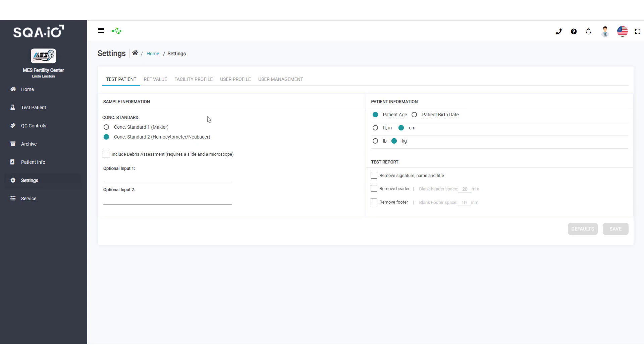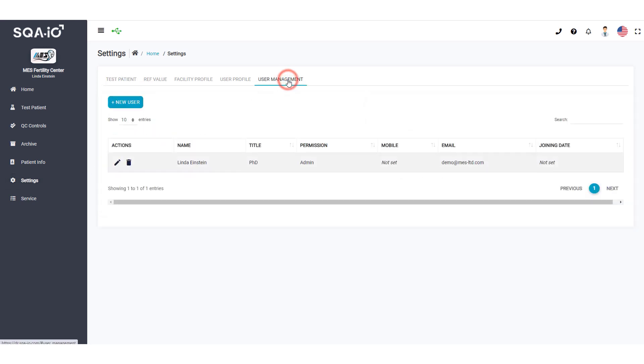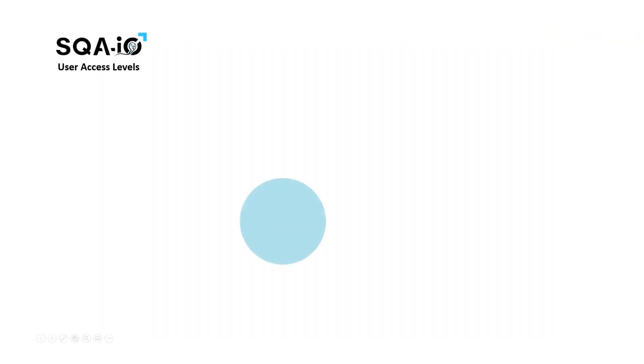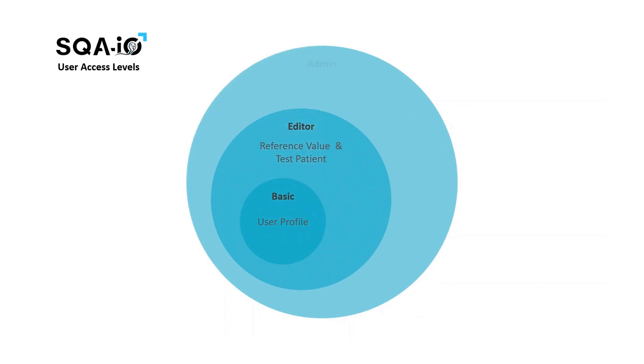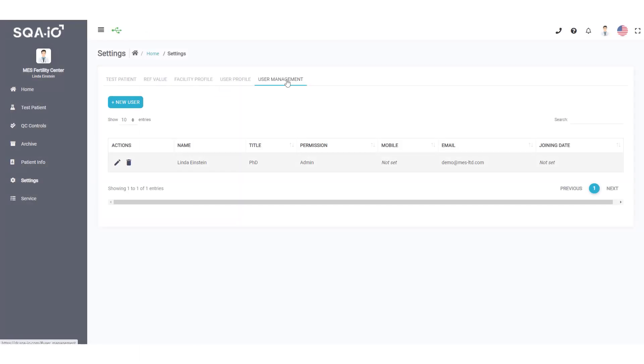Click User Management to comply with user traceability guidelines. The SQA-IO provides three levels of user access rights: Basic, Editor, and Admin. These three levels of SQA-IO access are clearly defined in the SQA-IO User Guide.